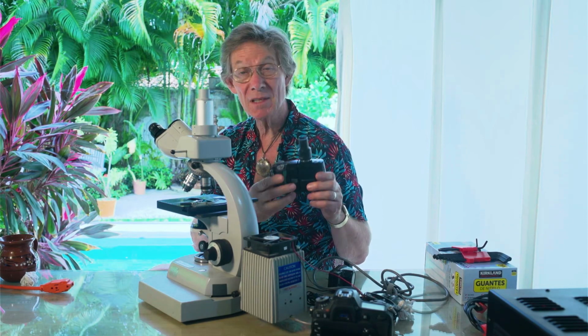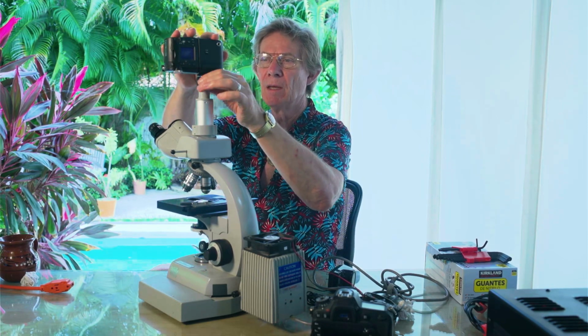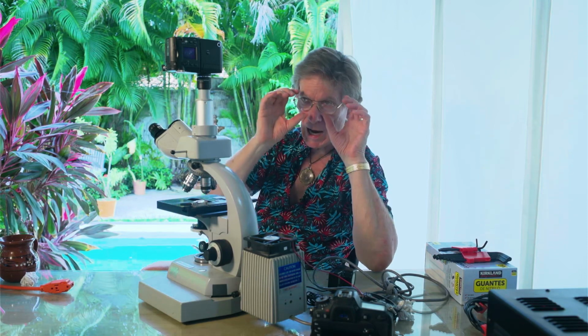Now, this is an older Nikon camera that I've used for many, many years, that I still use at times, and it fits on here, just like that. So it has its own eyepiece, and that is the piece, not unlike the pieces here, these lenses for our eyes. It's a separate eyepiece for the eye of the camera.